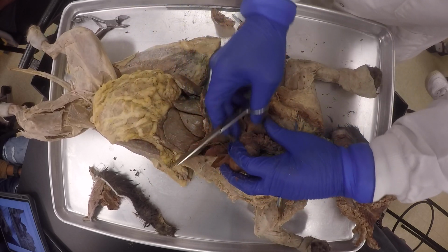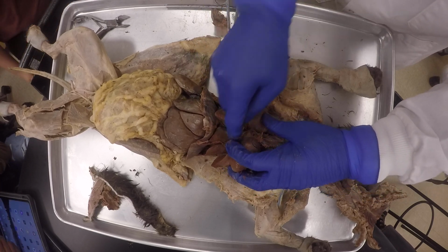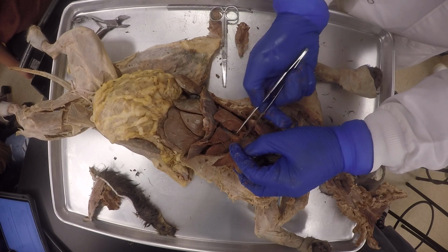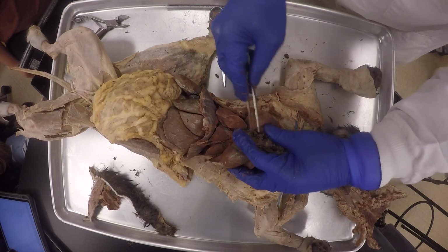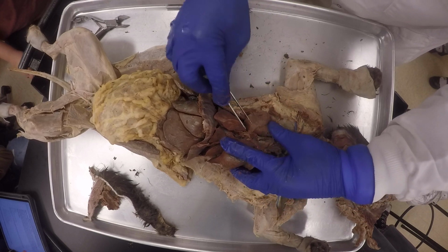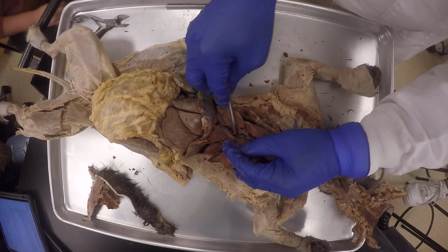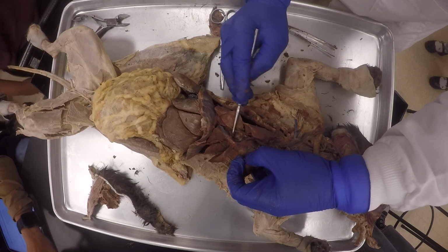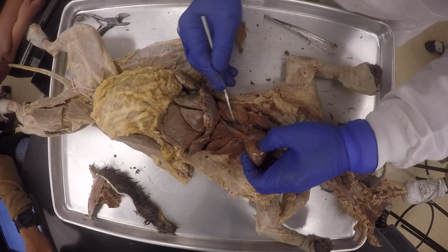So now I'm going to cut some of the pulmonary veins or pulmonary arteries, because the arteries will be okay, and the pulmonary veins, because they're going to and from the lung. Be sure to leave the azygos vein. You understand? This is the azygos vein right there. It's nice and thick. There's the phrenic nerve right there. Okay, you could see the bifurcation already down there.